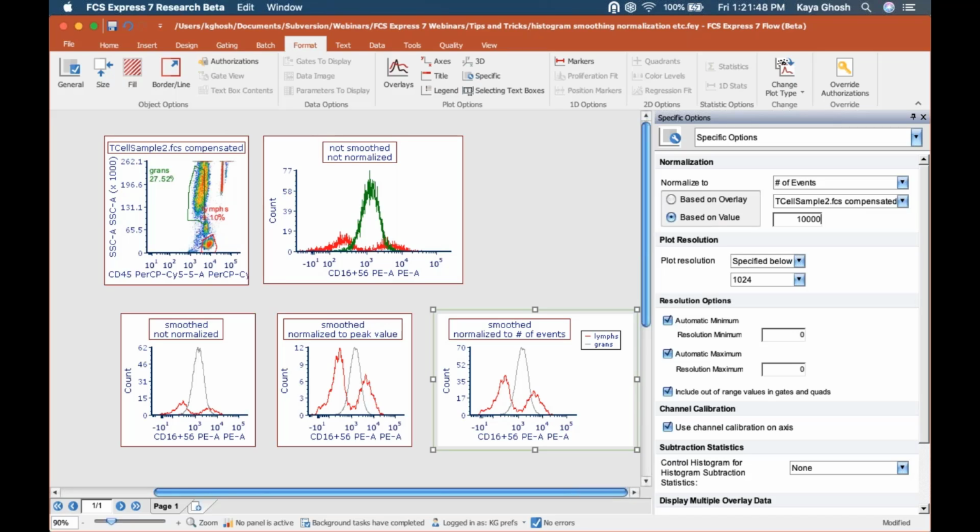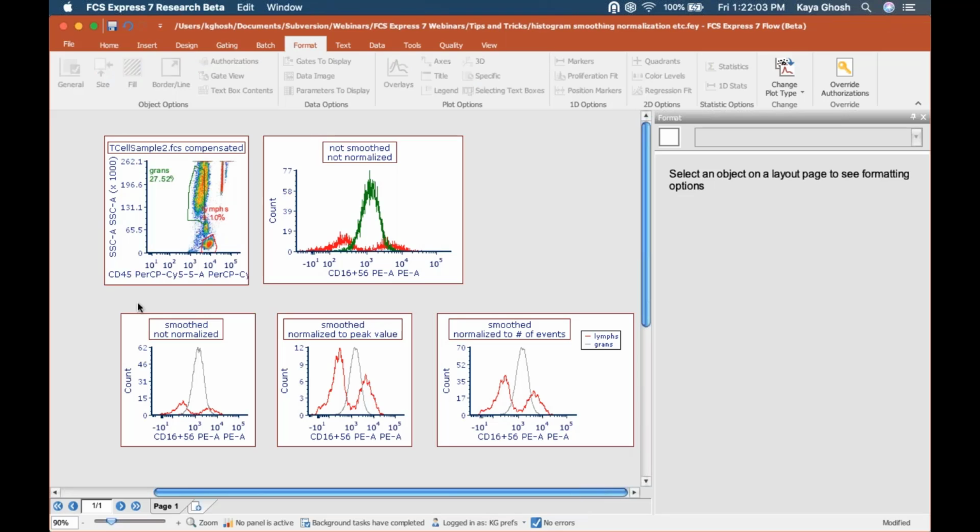So to get to the user options window, I'm seeing a question coming up. You would just go to File tab, Options, okay? Or you can come down here and go to Options, and that would set up your default user options going forward. Okay, so there's other things you can do about histograms, which are pretty nice.